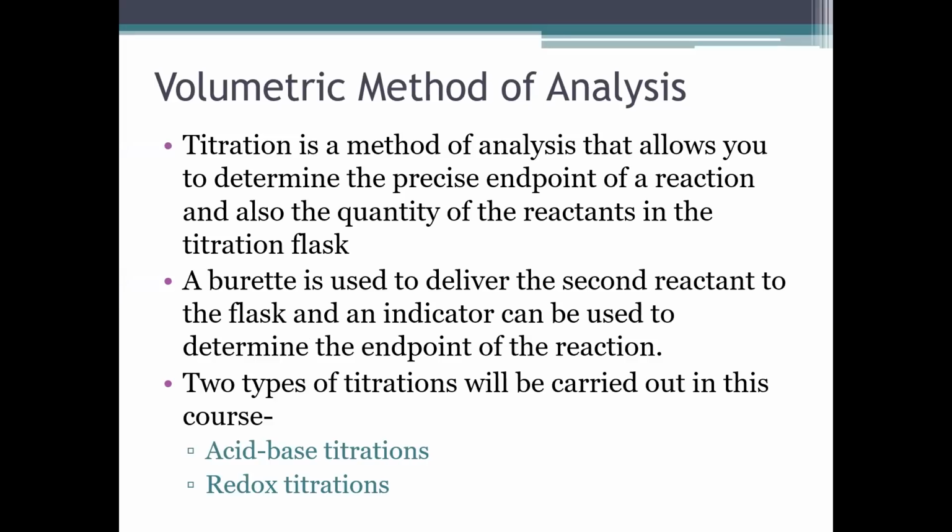For every titration, as you know, your burette is used to deliver your reactants to the flask, and you use your pipettes to take your reactant into the conical flask, and the two of them are titrated against one another. In every titration, you know the end point of the reaction by the change in the color of the reactants at the end of the titration.